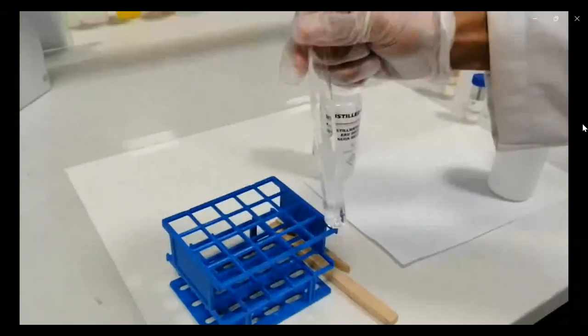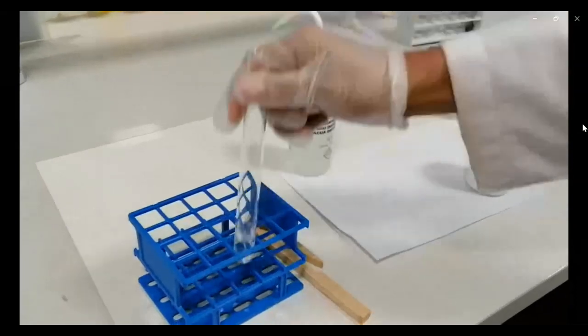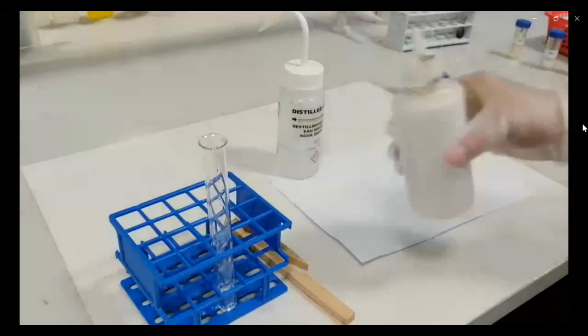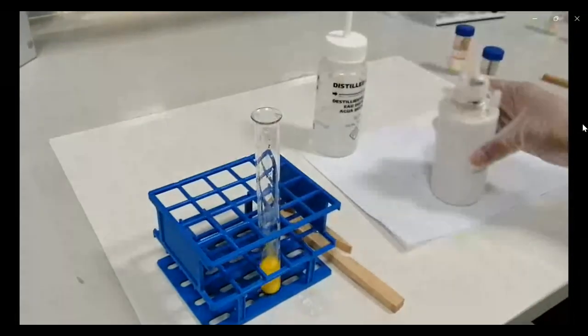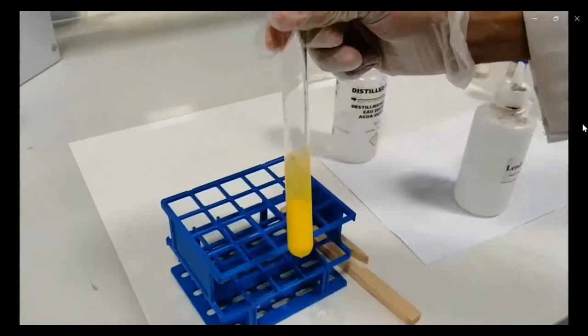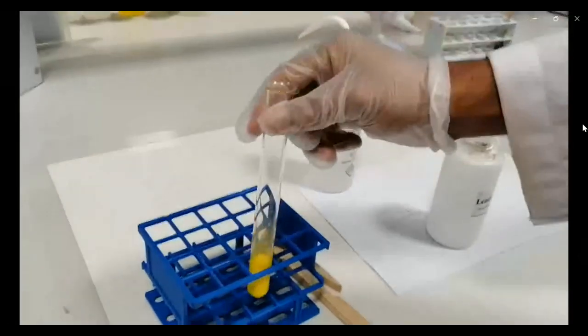Just prepare a solution, mix the salt with water, and then add lead acetate. In case of iodide, you will see a canary yellow precipitate. Very, very clear, which is lead iodide.